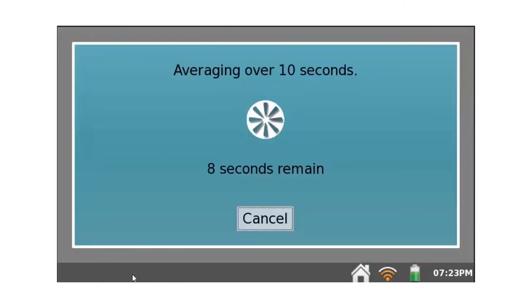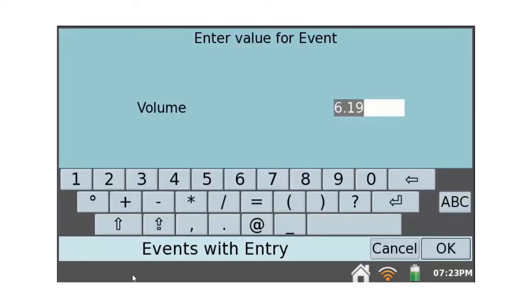The idea of keeping the points along the way. This one is pretty far along but to show you how this works, when I hit the keep button, here's what will happen. Come and hit the keep button, get this. He's going to do my averaging over 10 seconds like we requested.